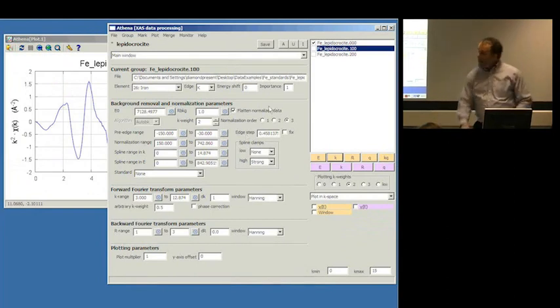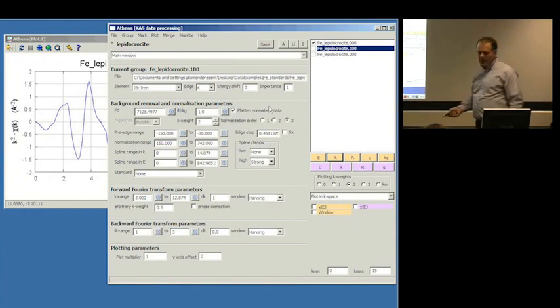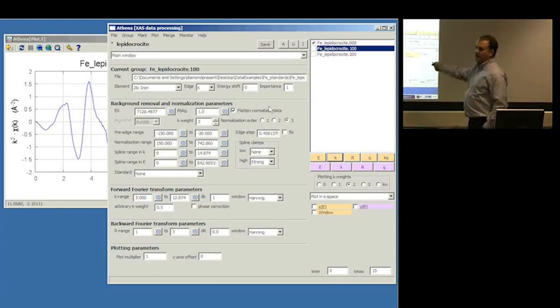And if we have a bunch of scans on the same thing, and that's what these are, just sequential scans that I took at the beamline at room temperature on the exact same sample, it's nice to plot them together to make sure that they actually plot on top of each other. So the thing to do, as I suggested earlier, is to tick the little box there for each of them. That would be a little annoying if there was a big long list and you had to tick a whole bunch of things. These buttons up here are shortcuts.